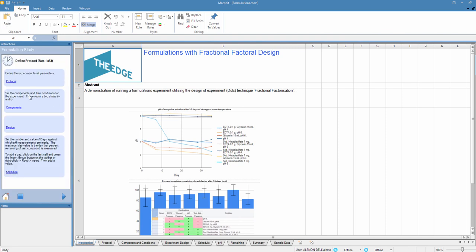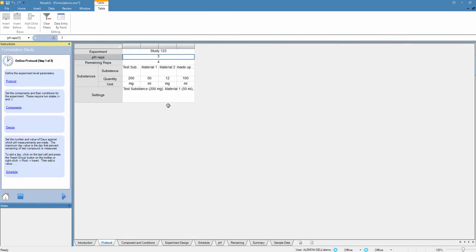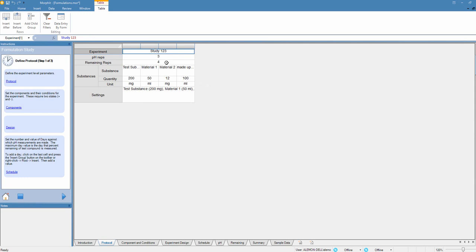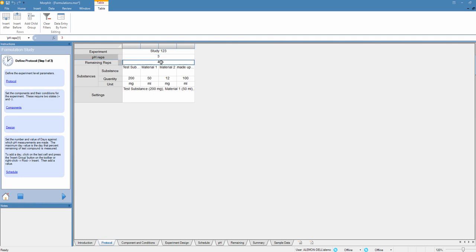I'll run the workflow. First we're going to define our protocol. In this case I'm going to be running study 1, 2, 3. We're going to be measuring three different replicate samples to track the pH of the formulation over the course of the study. We're also then going to be measuring four replicates to measure the concentration of morphine in our samples.